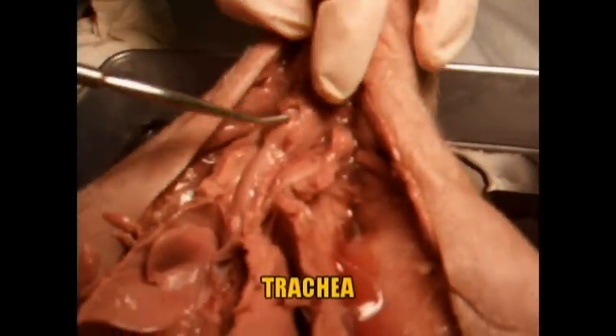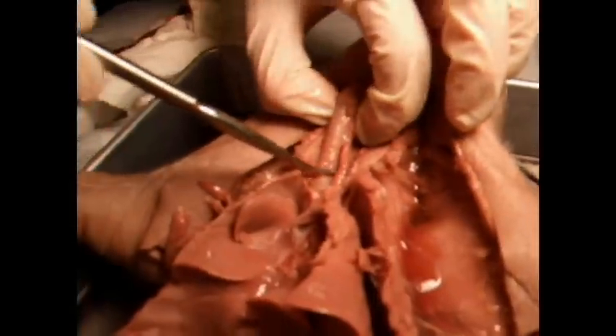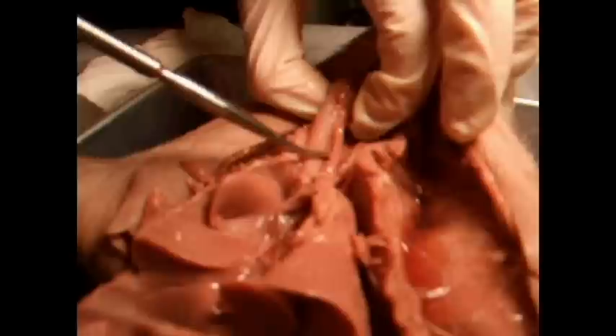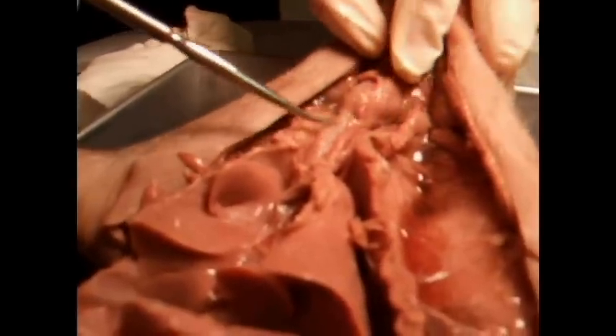And up here, the trachea — kind of looks like a beaded necklace — and right parallel to it is your esophagus. So food goes down here, air goes down here. If food were to get down your trachea, you'd start choking.